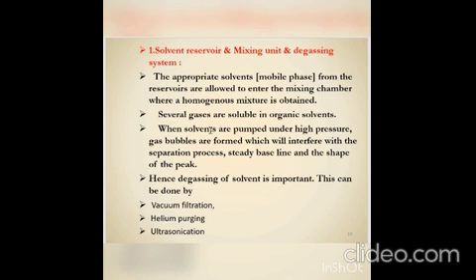If gases are there, they will interrupt the chromatogram and column. The solution is pumped with high pressure, so there will be generation of gas bubbles which will interfere with the separation process. So we go for the degassing system. Degassing is mainly done by vacuum filtration, helium purging, and ultrasonication. Mainly ultrasonication will be used. In this there will be sonic waves, and by the sonic waves we remove the air bubbles in the mobile phase.